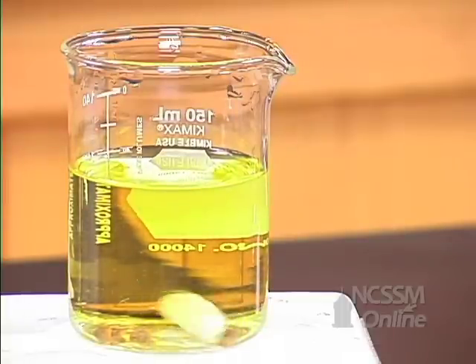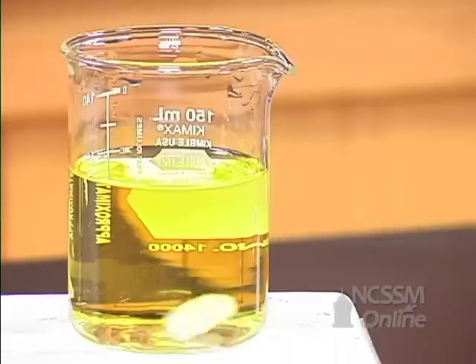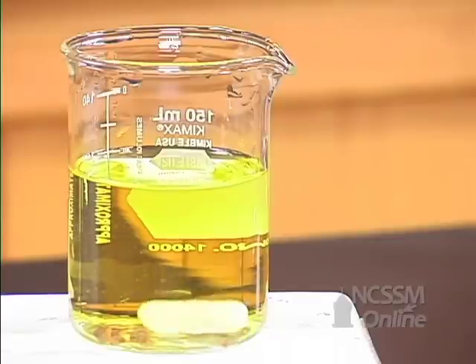The solution immediately turns yellow. The solution has turned fairly acidic. The pH has dropped rapidly.